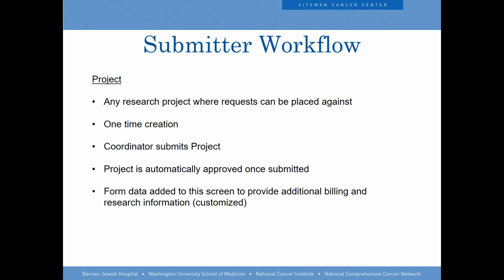And also setting up site services. So there's a way that you could have a curated list of services. The tissue procurement core only has a set number of things that they do. They might not do flow cytometry or some other specialized review, histology review and whatnot. And so you could set that up at the site level on actually what they do, so users can't go and make up services that they wish that lab would do. So that was the setup of being able to use projects.